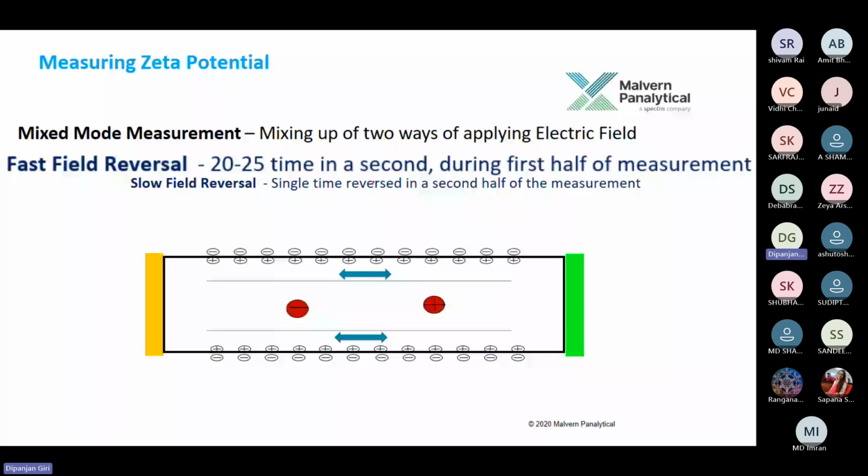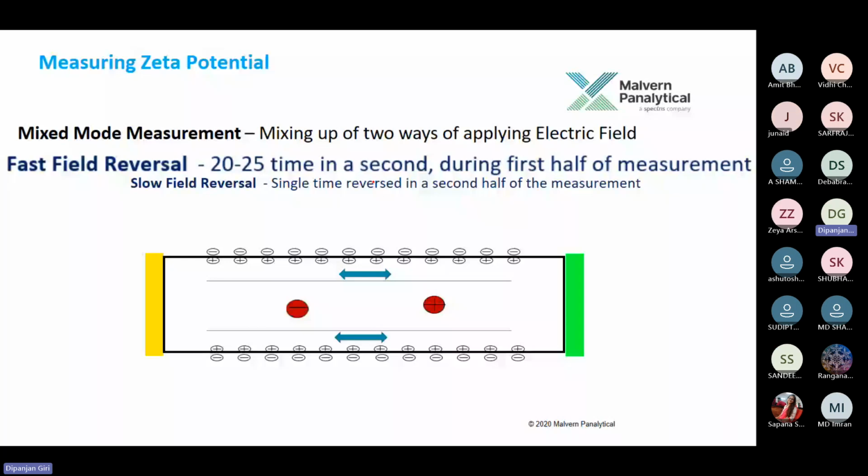The particles having a large zeta potential get influenced and dragged under the electric field. So their mobility and zeta potential get measured, while noise remains the lowest since the liquid movement does not take place in this case.